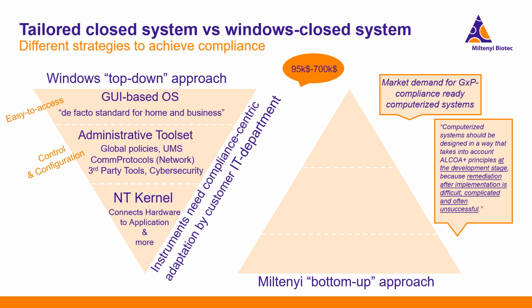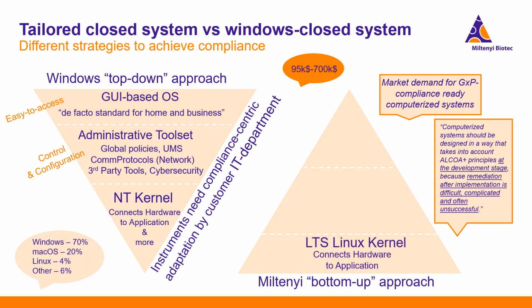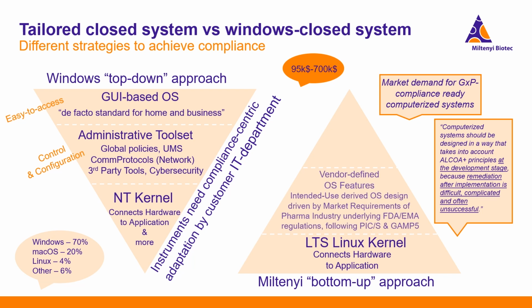We decided to develop our own operating system based on a long-term support Linux kernel. In fact, it allows for a cybersecurity advantage over Windows systems, given the small market share on computers of roughly 4% compared to a 70% share for Windows. In addition, we can tailor and introduce only features required for the intended use of the instrument and avoid unnecessary OS access by offering all features through the data acquisition software and not the operating system, by avoiding an operating system graphical user interface.